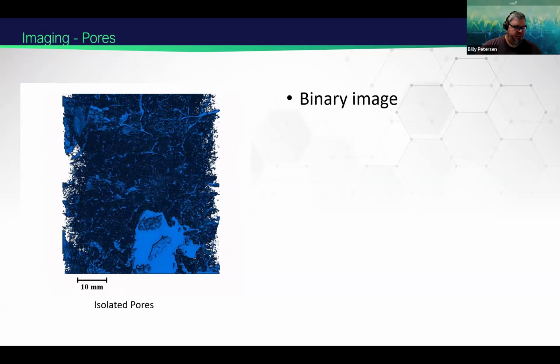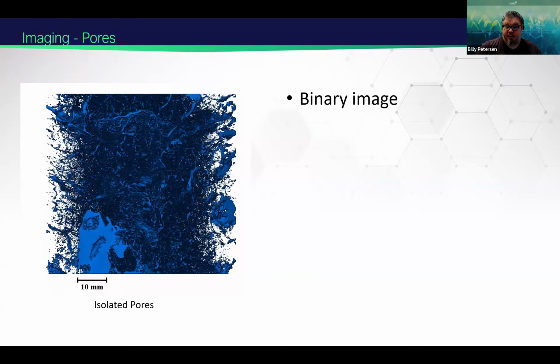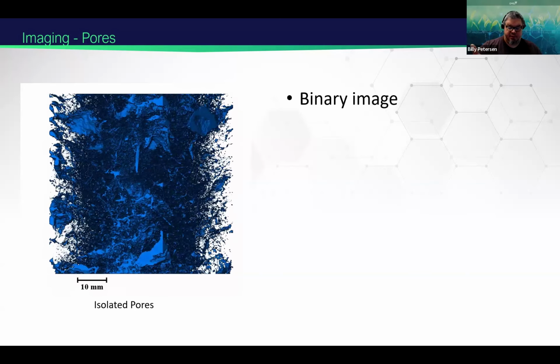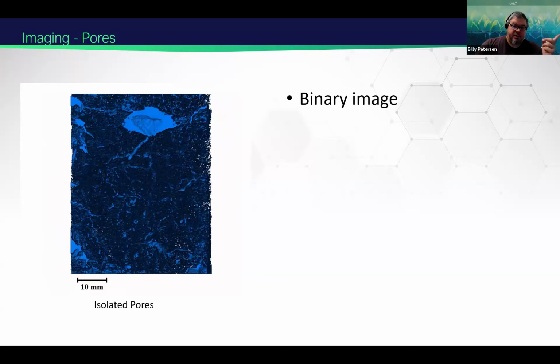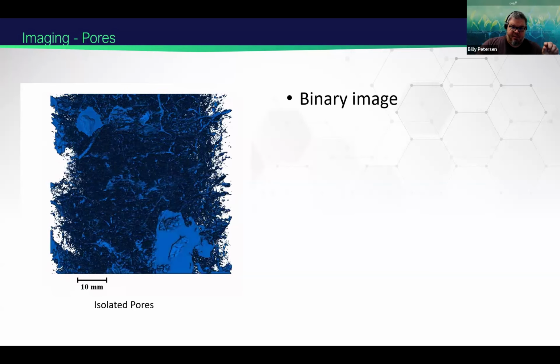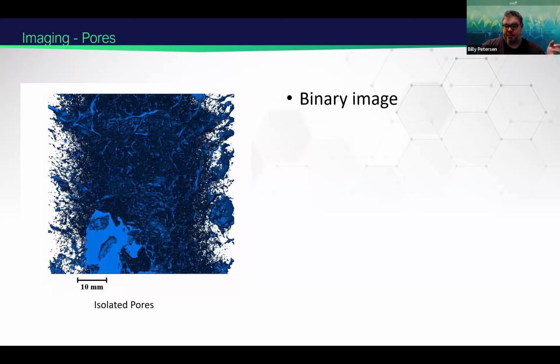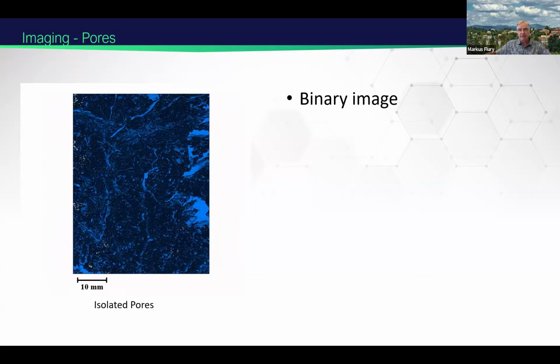Generally, if it's below our intensity or our scan range, then obviously we can't get it. We actually get a warning every time we run Aviso that it's unable to detect this many pores, but it's like 1%. I'm unable to detect about 1% of pores because they're so small. So thank you. No problem.